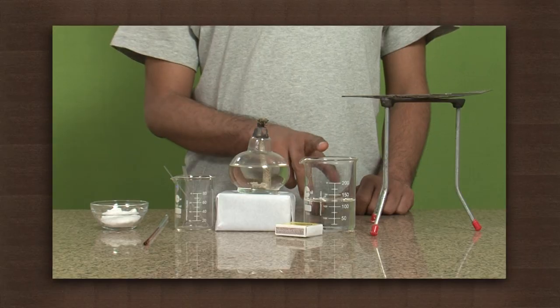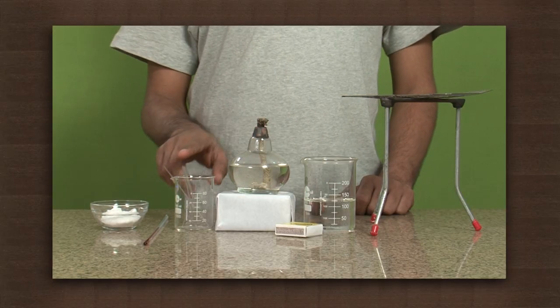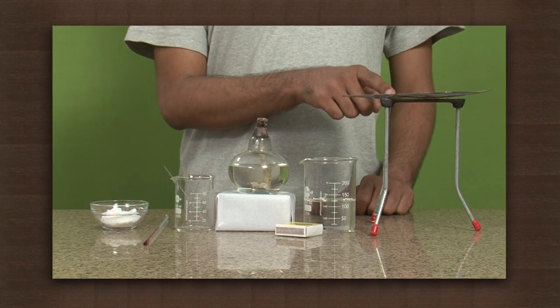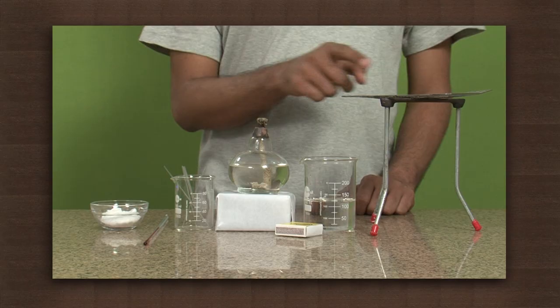Let us try to determine the melting point of a solid. We need naphthalene powder, a thermometer, a spirit lamp, glycerine in a beaker, capillary tubes, and a tripod stand.